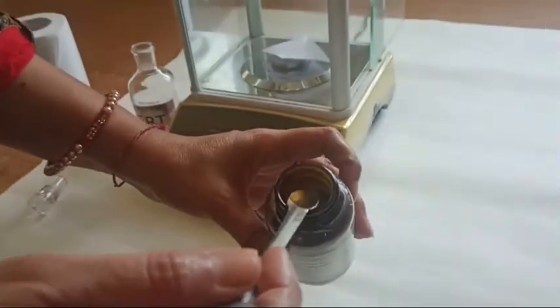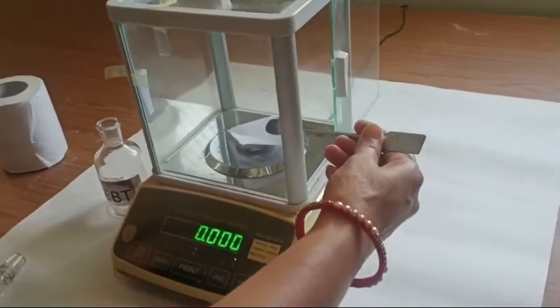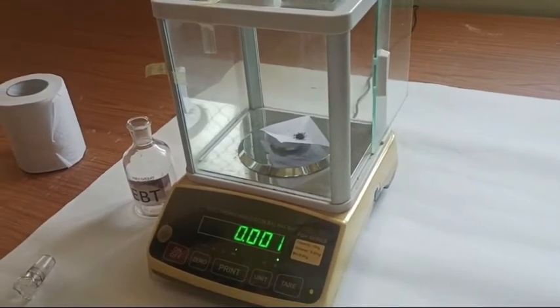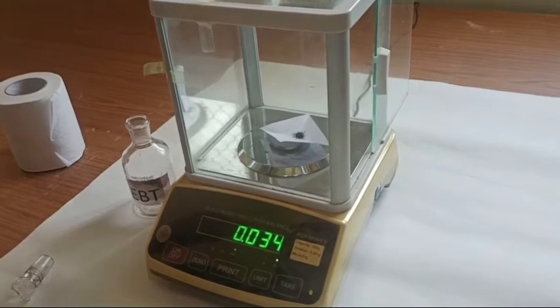So this is the eriochrome black tea. How it looks guys. You can see it. Now I put it over my paper. And here is the weight of the sample which is kept on this white paper.